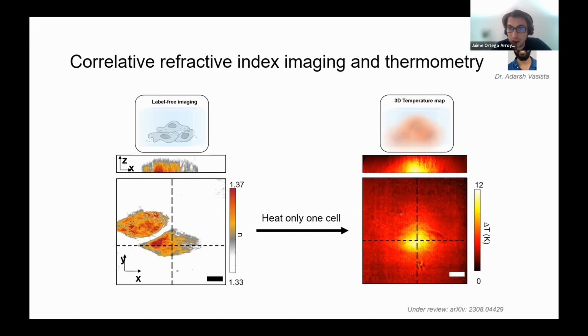So this is a little bit answering back to the previous question. And can you remind me just the first question again? So the first question was about the refractive index gradient. Yes. So when you use optical diffraction tomography, yes, there are constraints regarding the refractive index gradient. It depends on which type of equation you want to solve, right, which system. So you can do the Born approximation, you can have the Rytov approximation, and then there are more complicated ones. For our case, we work in the Rytov approximation, and I think what's important is that the gradient itself is smaller than, I think, pi over 2 or something like this.